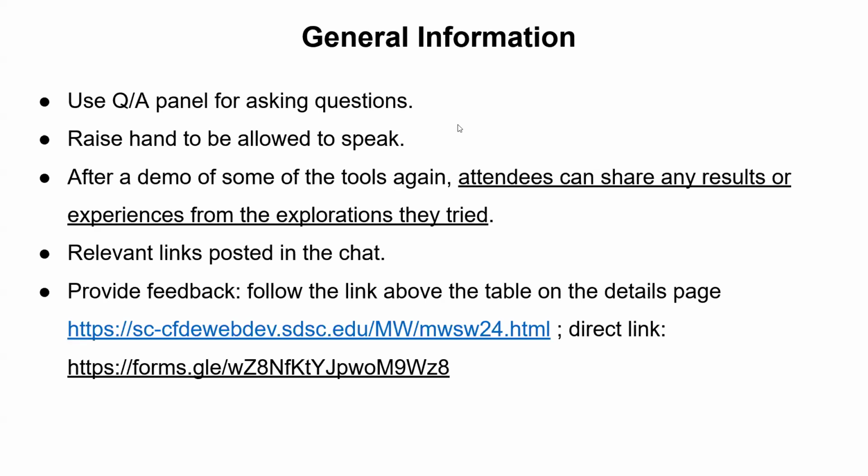So today's plan is that after a demonstration of the some of the tools that we have already seen, attendees are welcome to share any results or experiences that they got by exploring some of the tools over the past 3 days. As I go through the demonstration, our colleague will post the respective links in the chat so that as I am going through the demonstration, you can try those. And if you face any questions, please raise hands so that panelists can unmute you and intervene me so that if there are any questions, I can answer them.